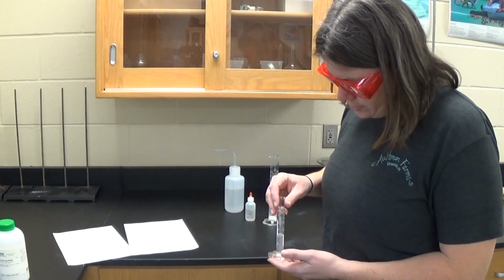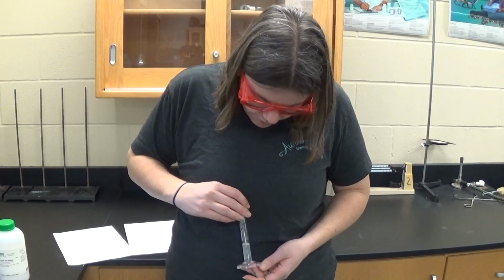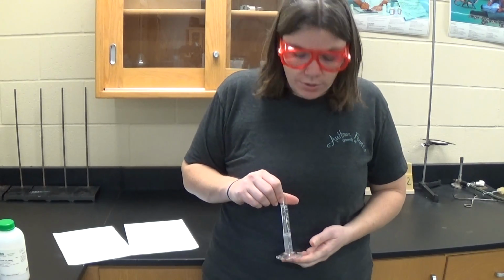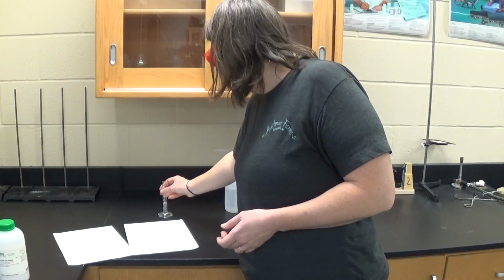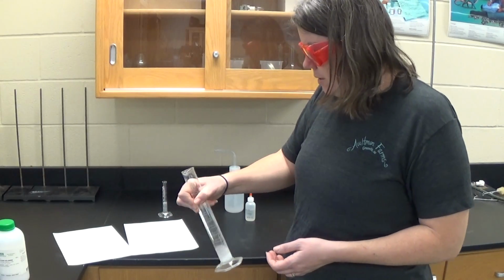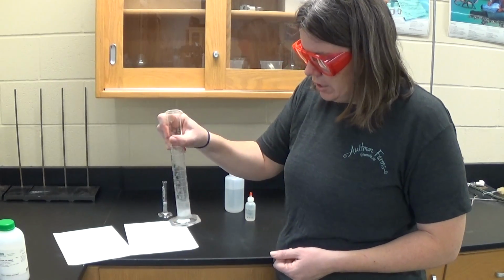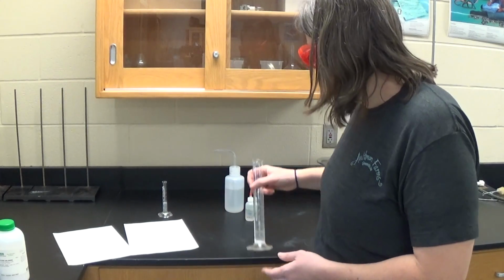And if we look here, and I'll put it in front of my shirt again, sorry, so you can see, we can see that the liquid has become almost clear. So all of that solid has dissolved, and it's still warmer than the room temperature water. And then here, one more time for the sodium bicarbonate and vinegar. It is dissolving. It is not producing any more bubbles.